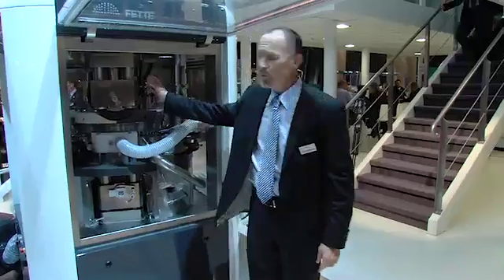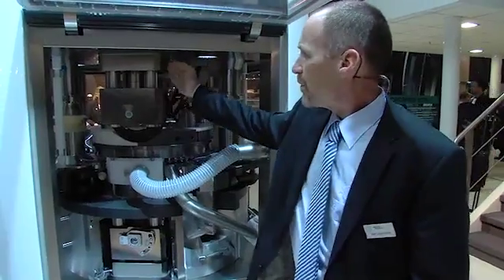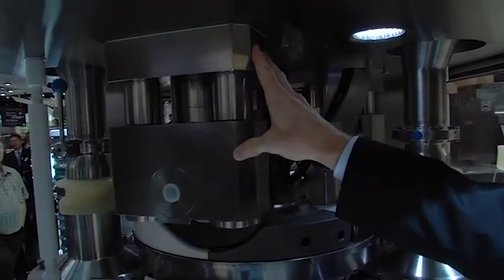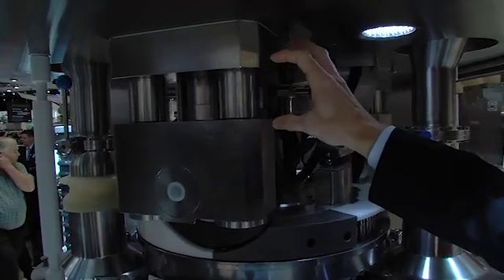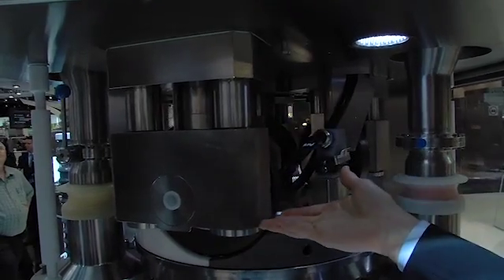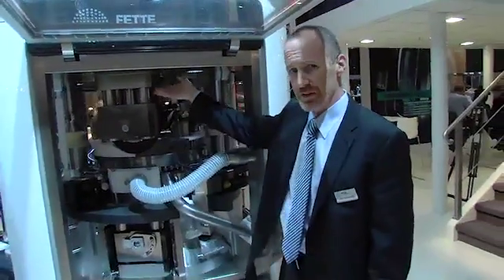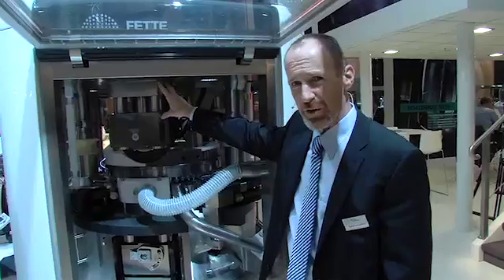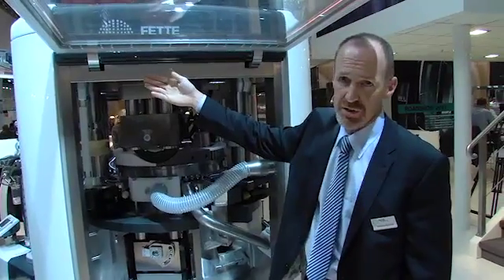We have two other primary complete redesigns with the FE55. The first, which we can look at on the upper assembly here, is the compression station assembly itself, extending to all of the stations installed in the machine. With a greatly increased range of travel on the roll assembly and an automatic parking position, the roll assembly and the compression roll itself can move much higher than in the past, eliminating the need for reference marks and facilitating turret removal without removing or sliding the compression stations back.